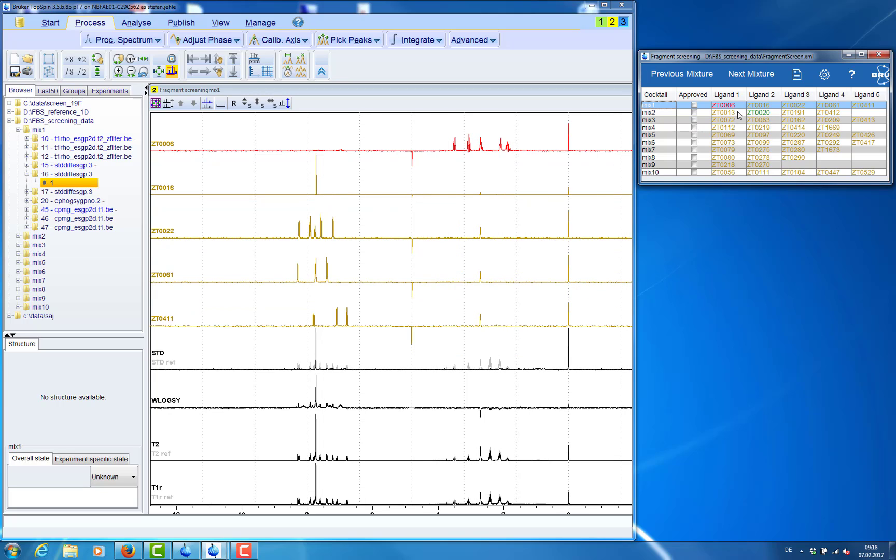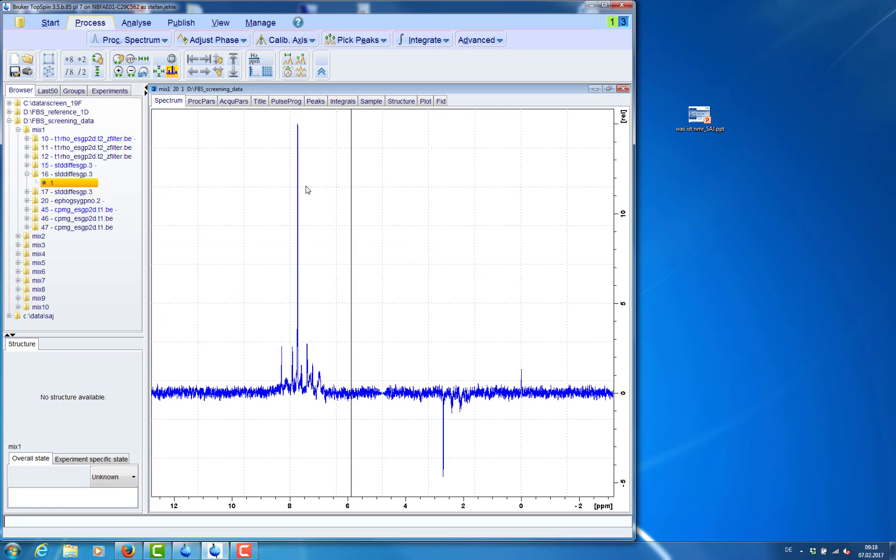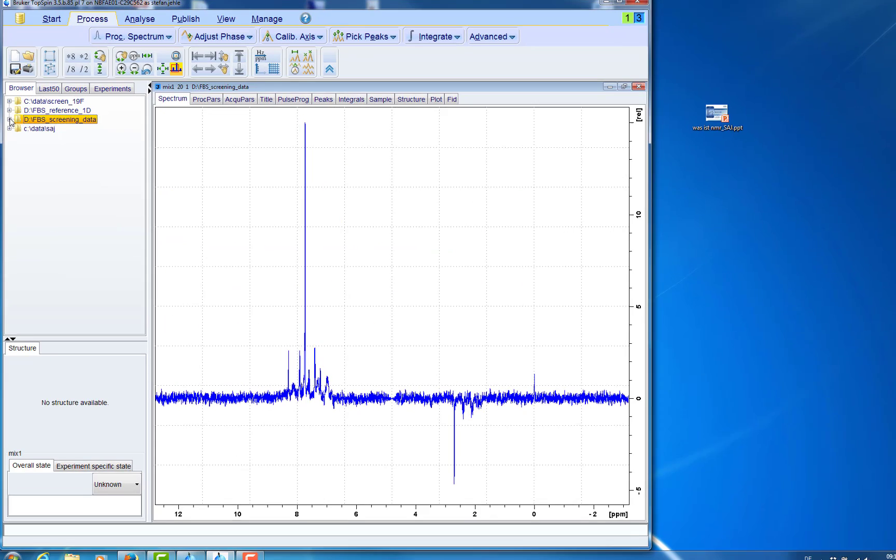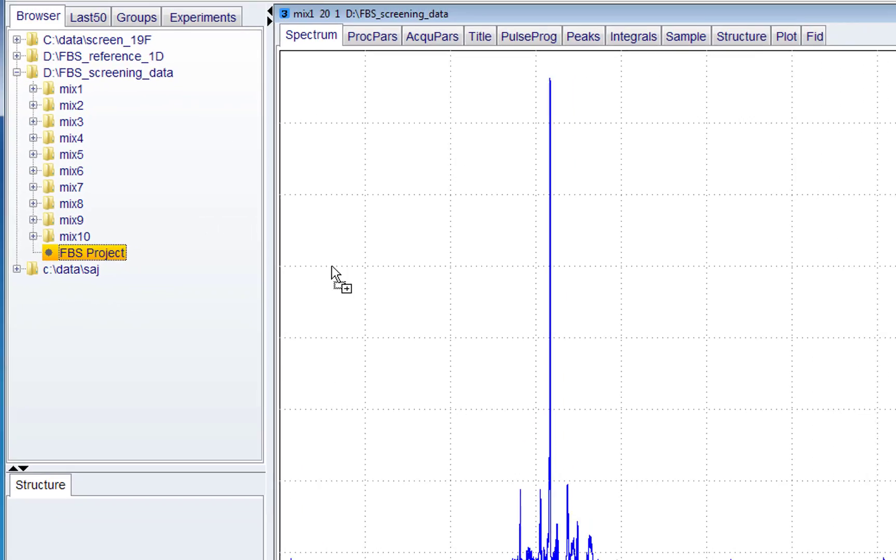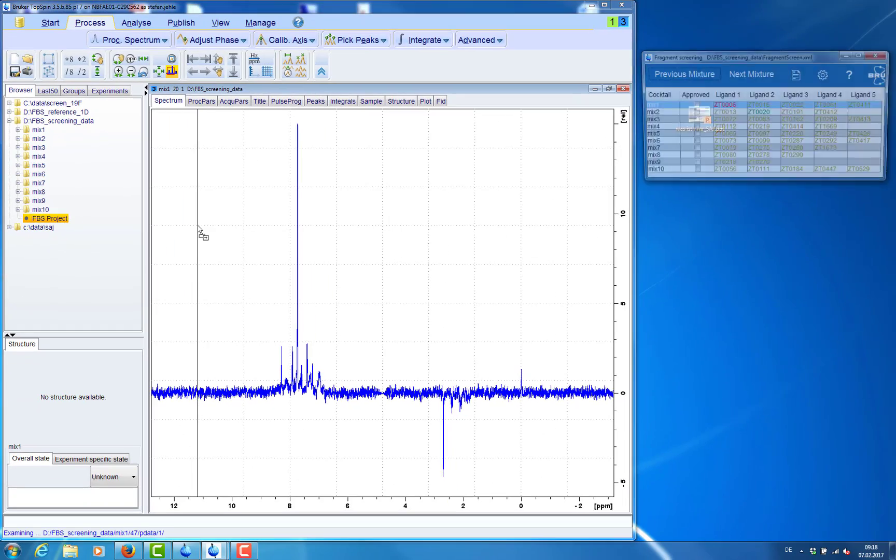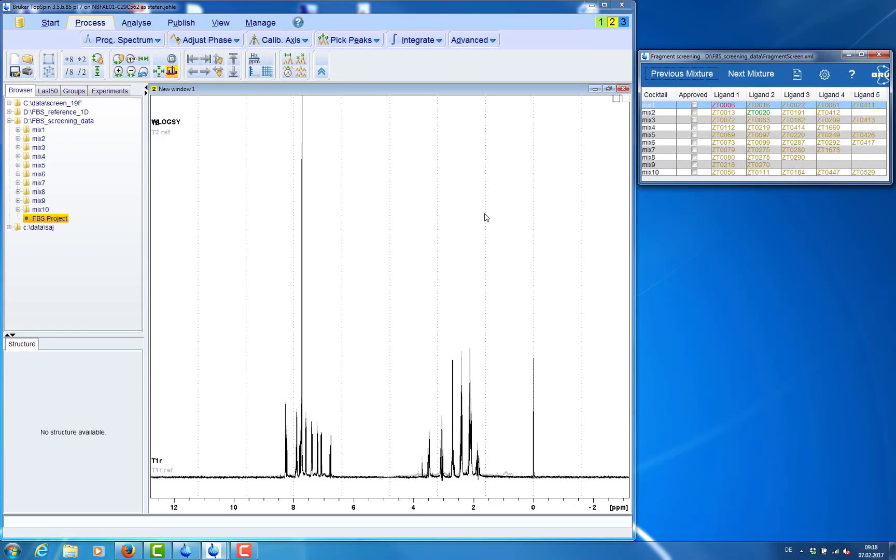When we are done analyzing we can close the project by closing the project table. All our modifications have been stored in a project file that is in the data folder. And we can reopen the project by drag and drop of this project file.